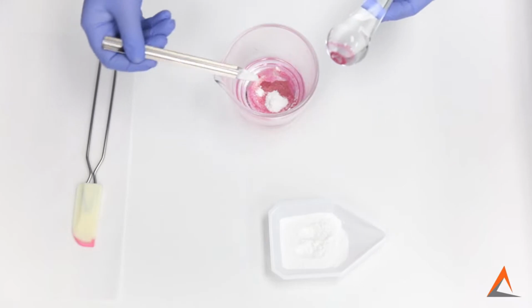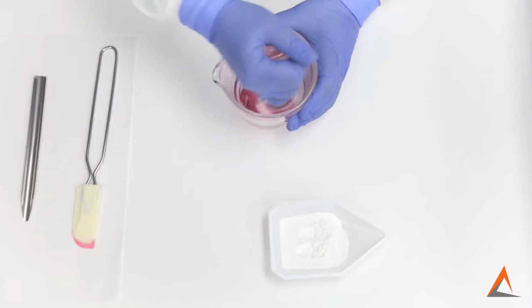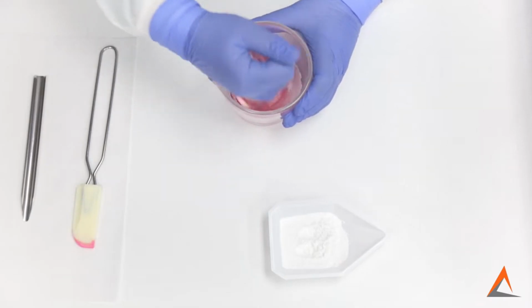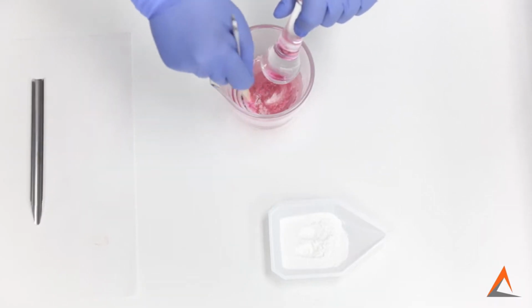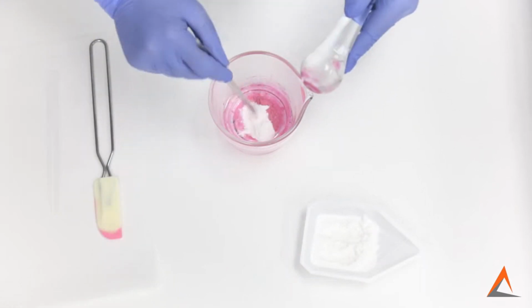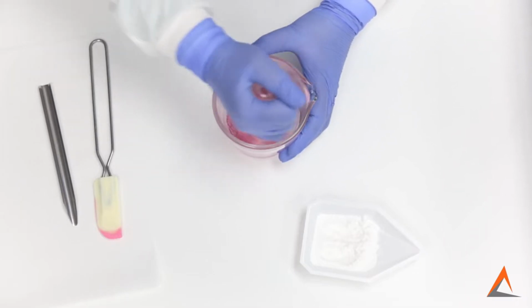Then, we repeat the process by continuing to add an approximately equal quantity of the larger powder into our mortar, followed by mixing until all the powder has been added. This larger powder is considered our diluent powder, and this is where the term geometric dilution comes from. After each approximately equal addition, you are diluting to the starting ingredient of the smallest quantity.